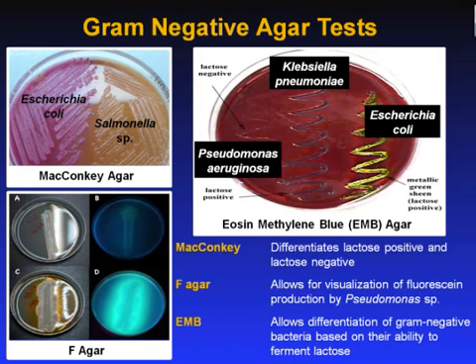A shows Pseudomonas fluorescens growing on nutrient agar in ambient light. B shows Pseudomonas fluorescens growing on nutrient agar in ultraviolet light. C shows Pseudomonas fluorescens growing on F-agar in ambient light, while D shows Pseudomonas fluorescens growing on F-agar in ultraviolet light.